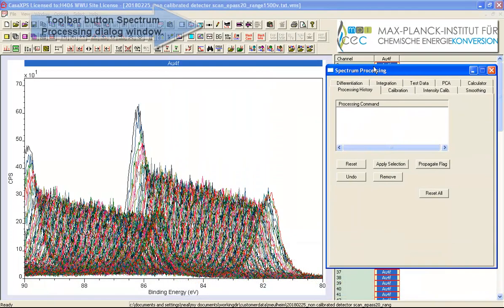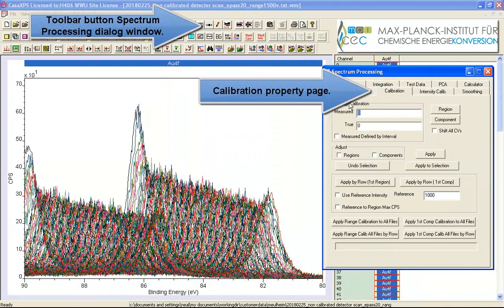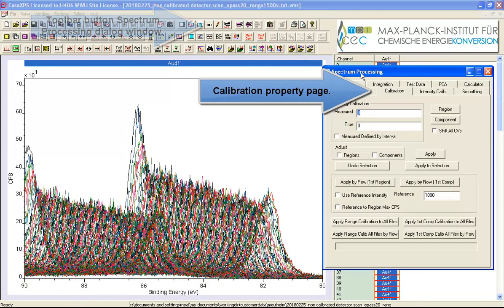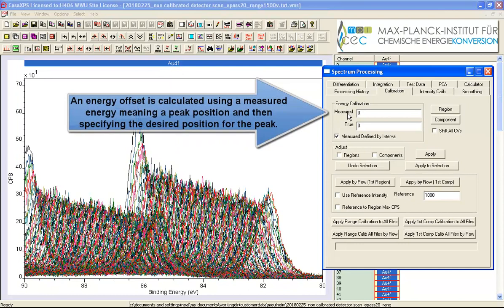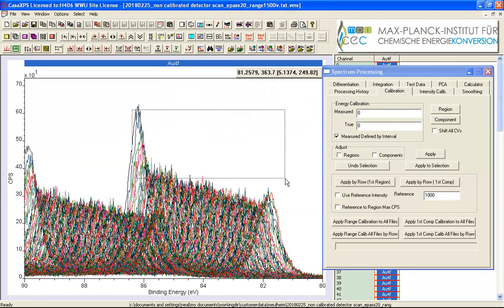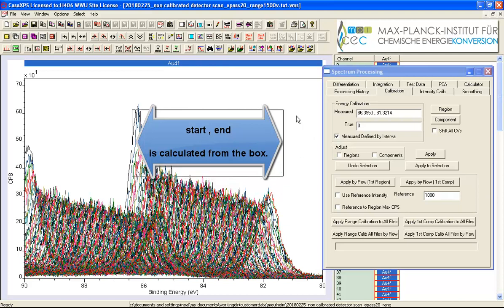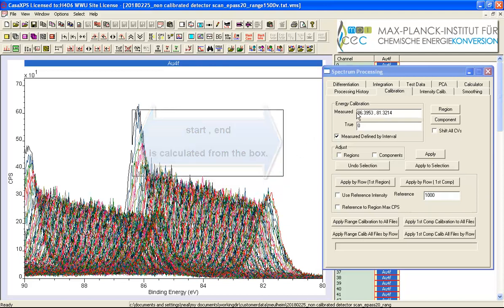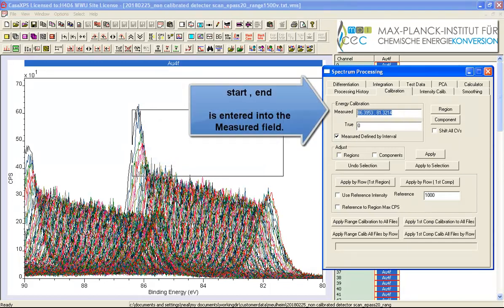And the first thing we'll do is calibrate using the calibration option on the spectrum processing dialog window and we'll use this option here that says measured defined by interval. Measured meaning this value here so we need to enter the value that we're interested in, the true value, but we'll first of all having ticked the measured defined by interval we drag out a box and as a result of that a range is entered into this measured field. And this range has been defined by this box that was dragged out.